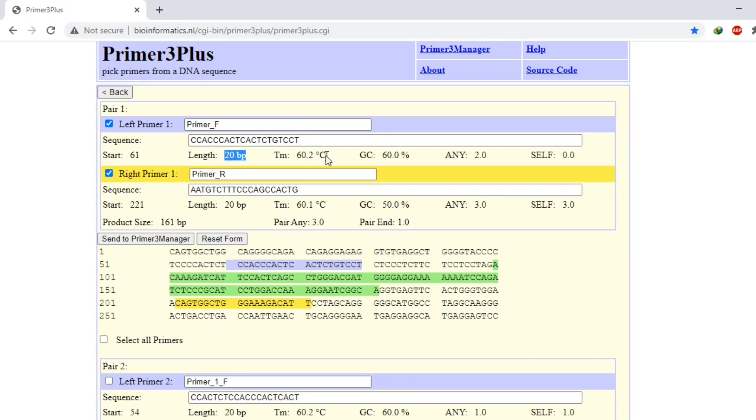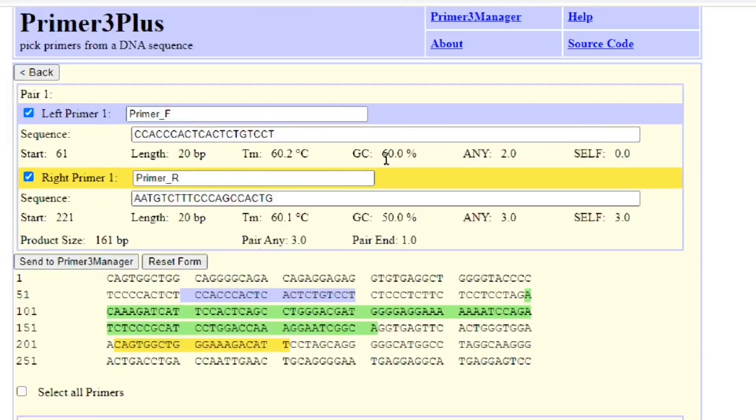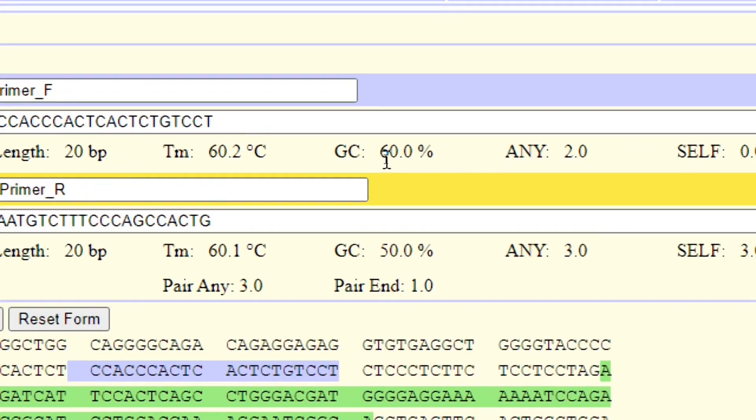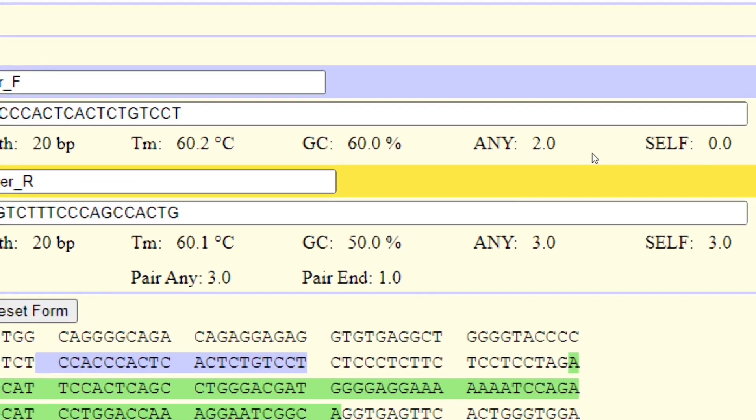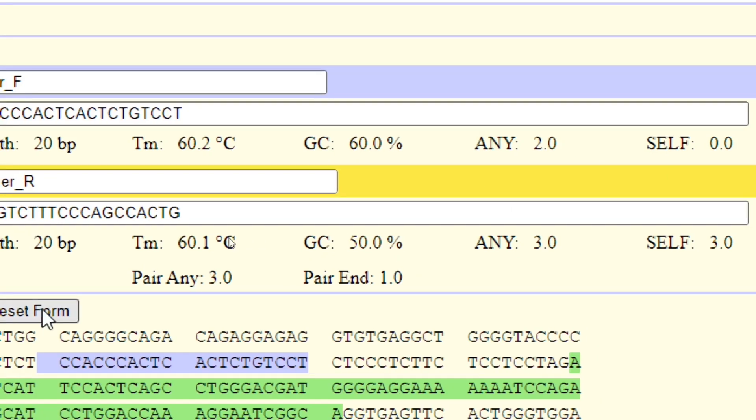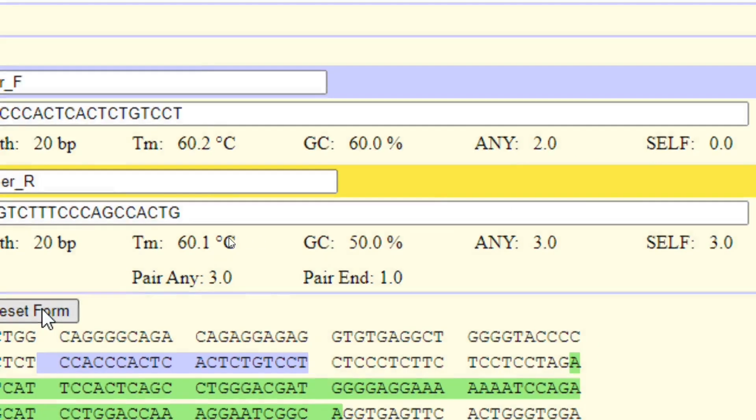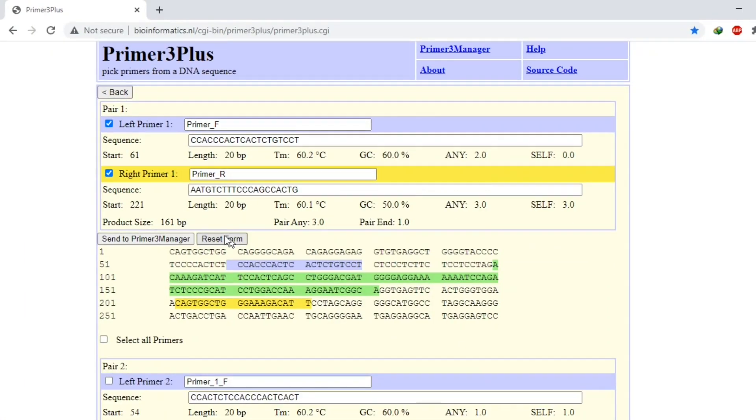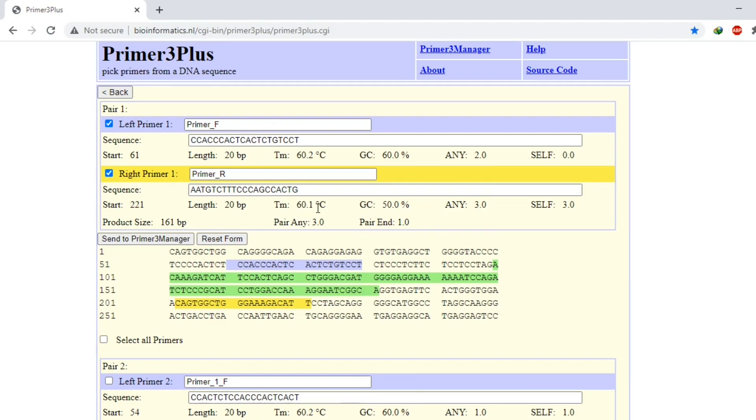And so the second reverse primer, the length for a primer is 18 to 25, and its melting temperature is 60.1 which is very close to 60.2. And its GC content is 50 percent, so I think these pair of primers is good.